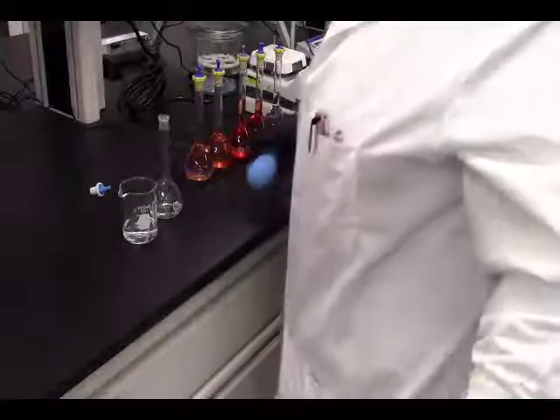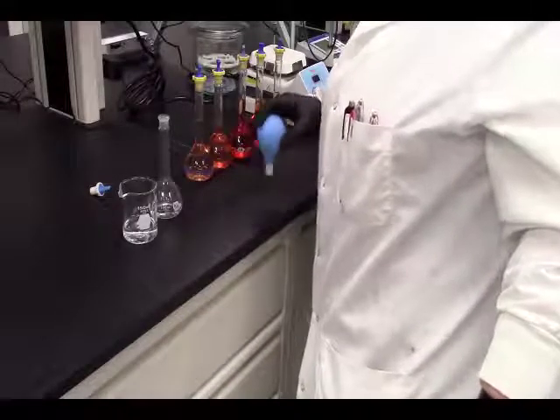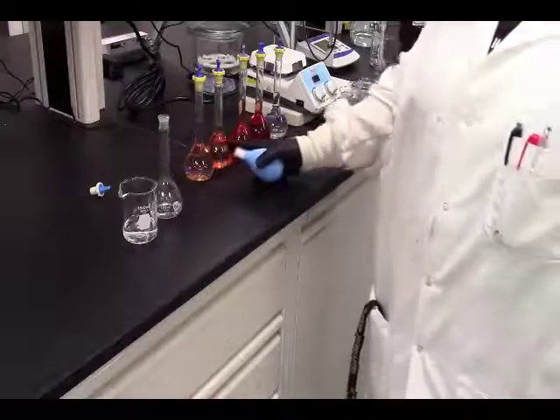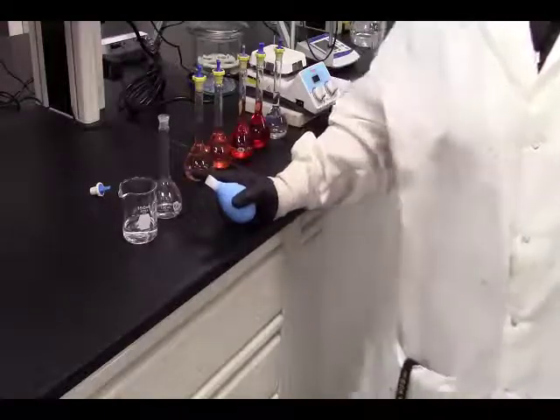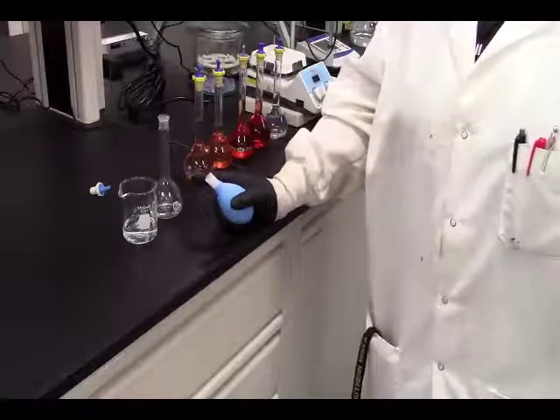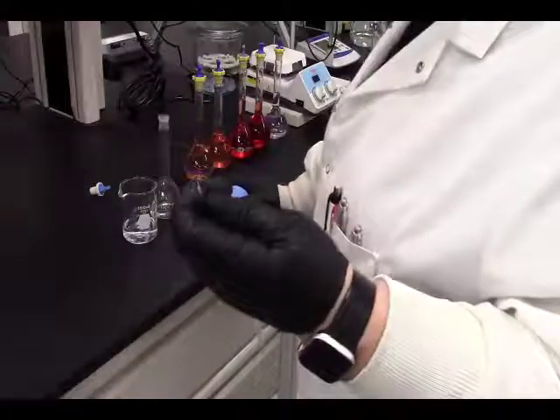Okay, this is your determination of iron content via UV-Vis spectroscopy. To save on time, the standard samples have been made with the exception of the first one, which we will use as our example to go through with how to make these. And the stock solution of your unknown as well as the 3 unknown samples have already been prepped also. But we will go through how we made those.